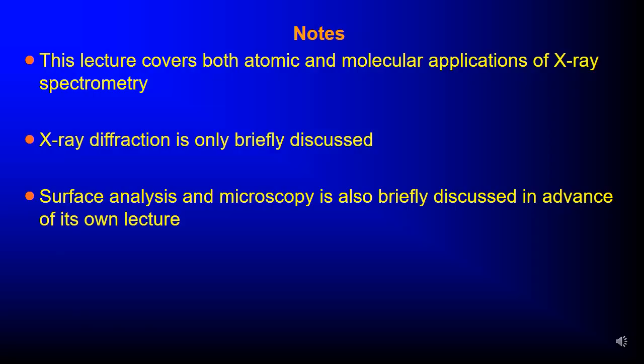We will cover the atomic and molecular applications of X-ray spectroscopy. X-ray diffraction is only briefly discussed, and surface analysis and microscopy is also briefly discussed in advance of its own lecture.